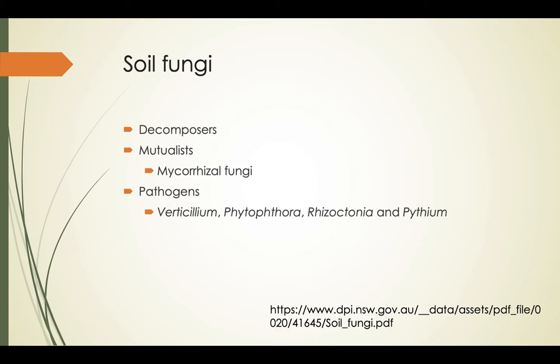They become the mycelium. That's for the case of molds. While other fungi such as yeast, when you grow them on agar plates, appear bacterial-like in terms of colony appearance.